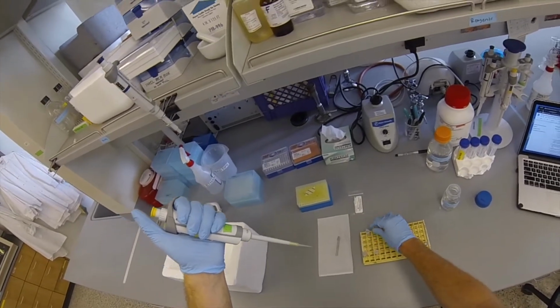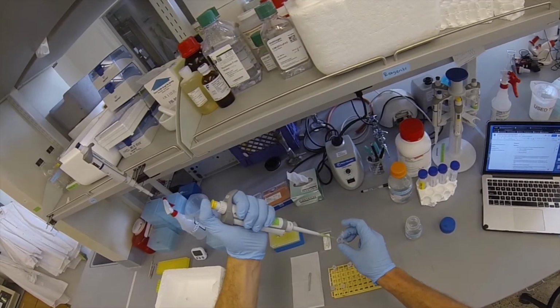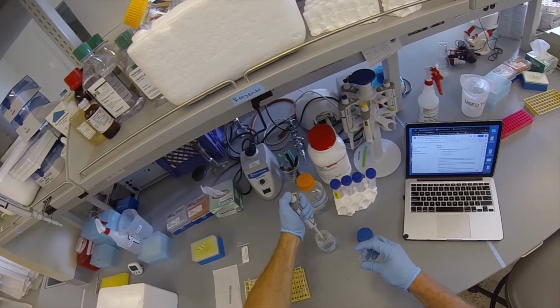You should only need one pipette tip for this step as well, although if you ever contaminate the tip with a sample, you need to remove it and get a new one.